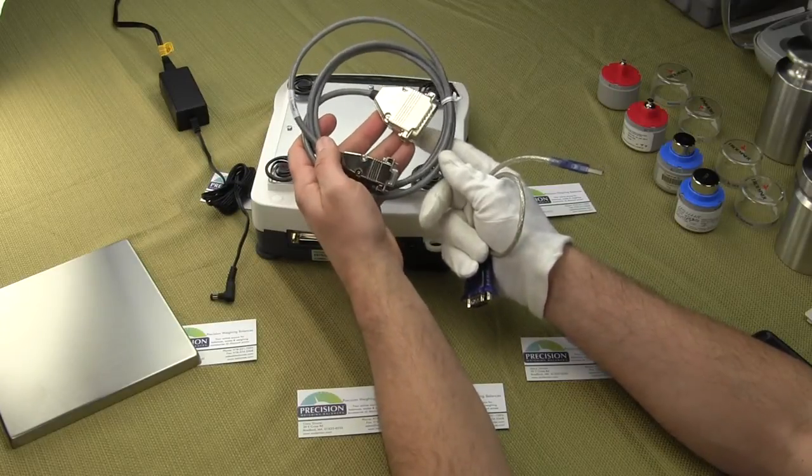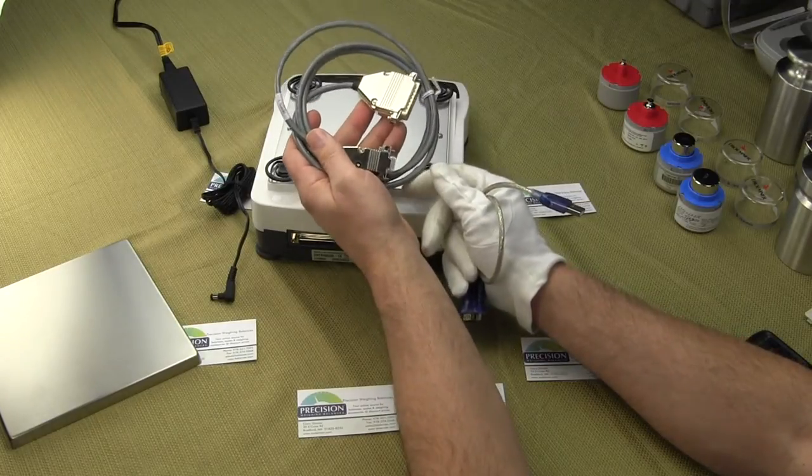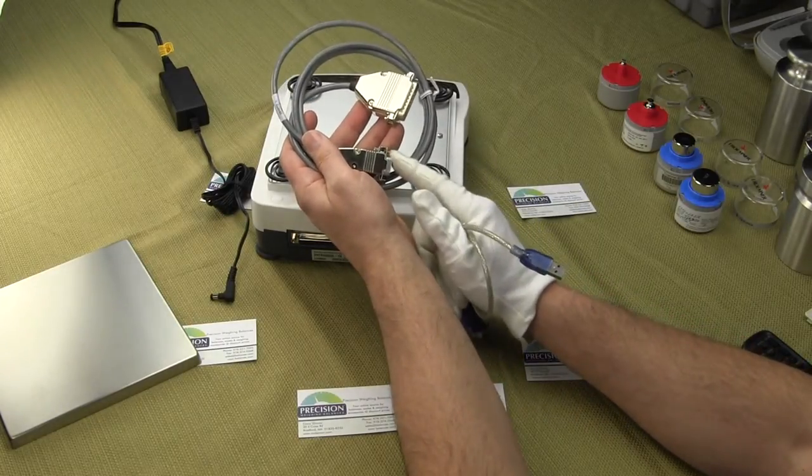The RS-232 cable itself is not a standard cable. You can look in the user's manual if you think you can make your own cable, but in all honesty it's not worth it — just buy the cable. This is Sartorius' serial cable that you would need if you were going to try to send data to a PC.